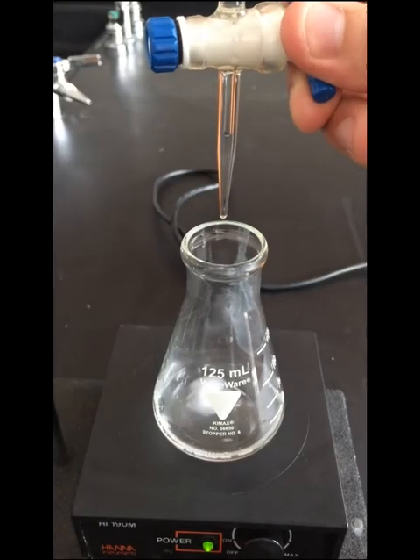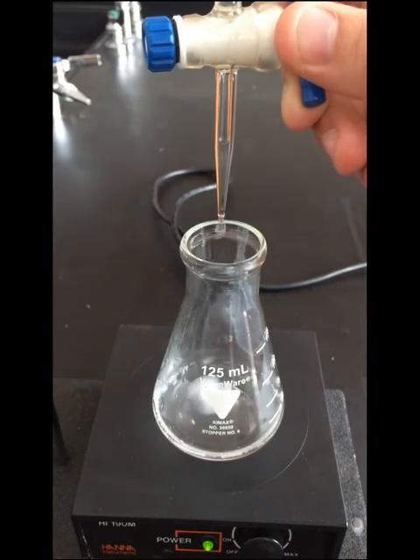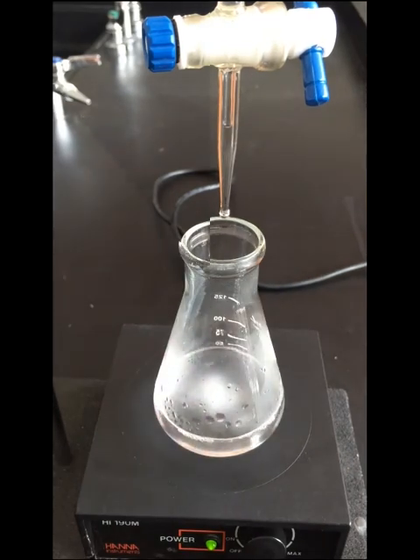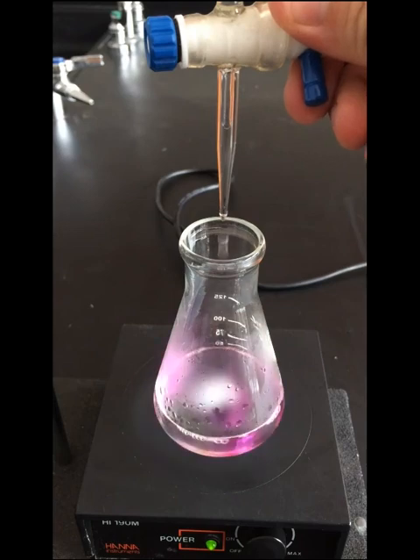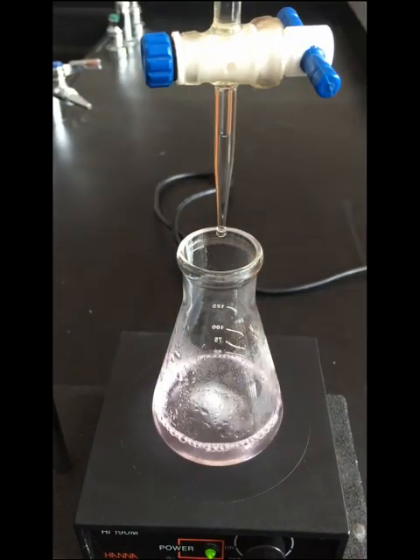The stopcock on the burette is gently turned so that we get slow amounts of the sodium hydroxide added to the vinegar, drop by drop. After some time passes, a pink color starts to persist longer and longer. Eventually, this pink color will persist for a long period of time, upwards of 30 seconds or more. When this happens, we've reached the equivalence point of the titration. Notice the pink color that remains in the solution.